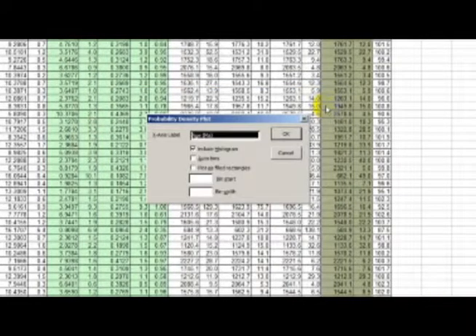So you click OK, and over here, the x-axis label, you can type whatever you want, but this is the age in millions of years. You can tick and untick this include histogram, so on top of the probability density function, it'll include or not a histogram, and for that histogram, you can make the rectangles filled or not filled.